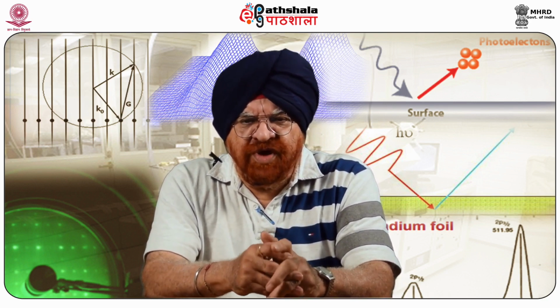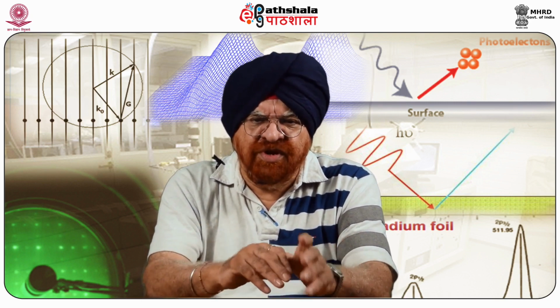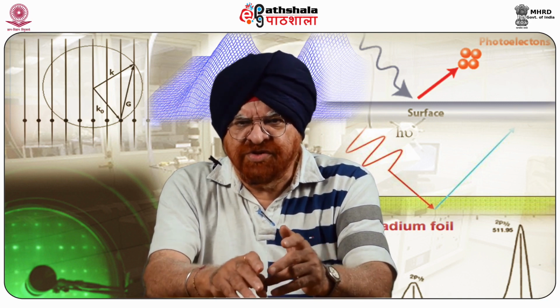Now the extension of KPFM capabilities to probe electrostatic and electrochemical phenomena at the solid-liquid interface is of interest for a broad range of applications. When I say broad range, that means from energy storage to biological systems.